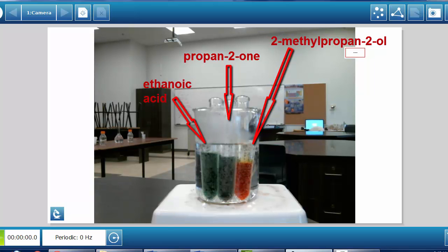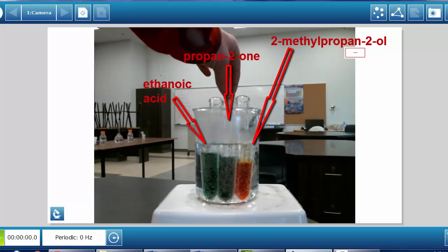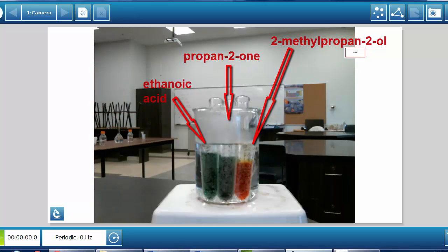All right, my second test tube there, which was propan-2-ol, is now propan-2-one. I'm going to test this for acidity. Okay, so you can see that there's none, so no matter how long I reflux it, nothing happens. So let's have a look at what the actual reactions are. All right, you're going to need the reactions, primary, secondary, tertiary, and the conditions. The conditions is an oxidizing agent and either reflux or not.